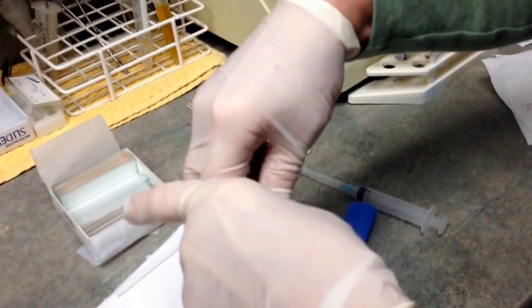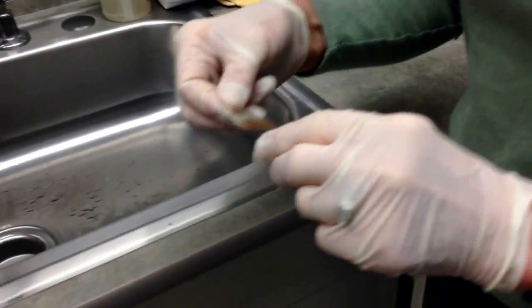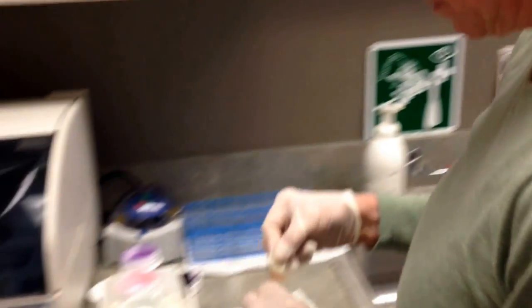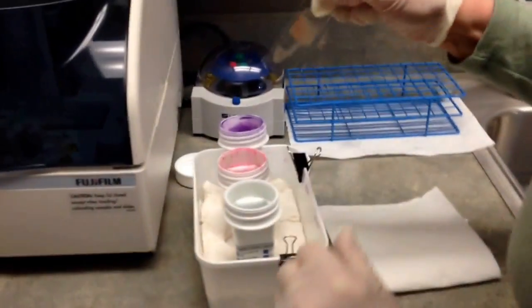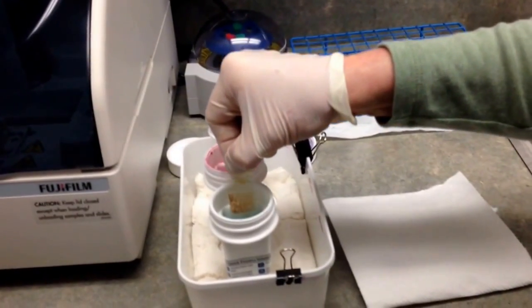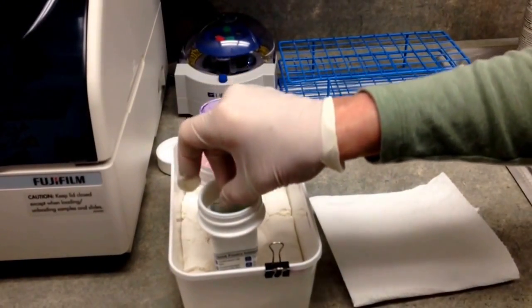Now you're going to go to your Dipquik stains. We're going to use a Dipquik or Diffquik stain, which is one of the most common stains you'll see in an animal hospital. It is possible your pathologist may ask for a different stain, but for most purposes the Dipquik works just fine. This is the second part of the fixing procedure — you're going to do eight slow dips in the fixative.